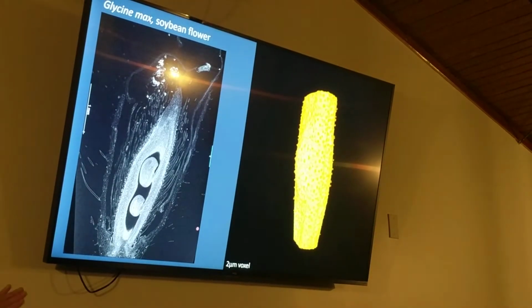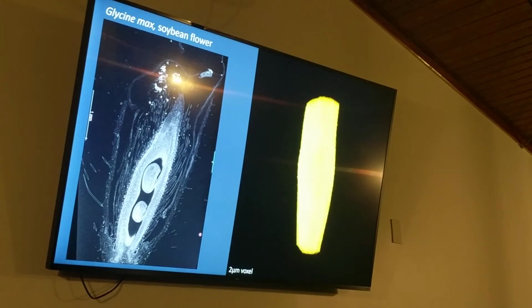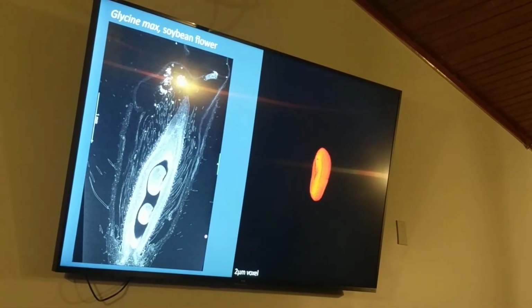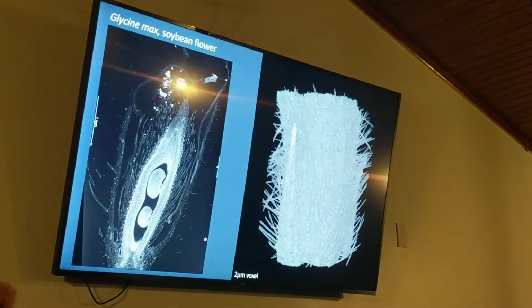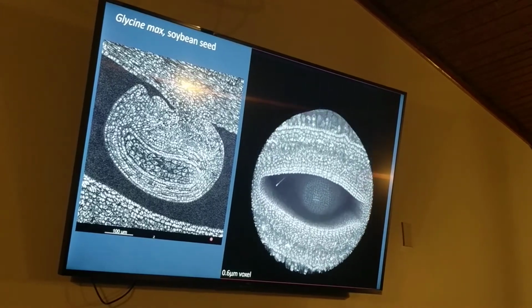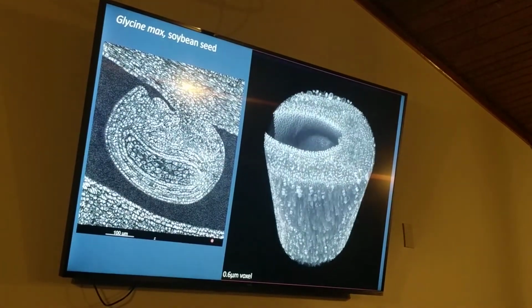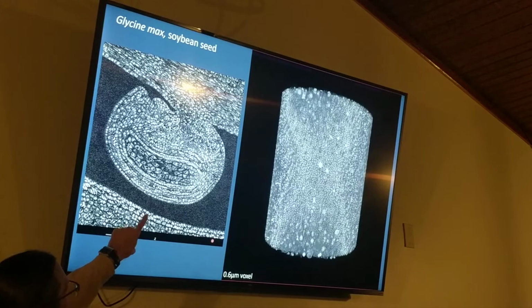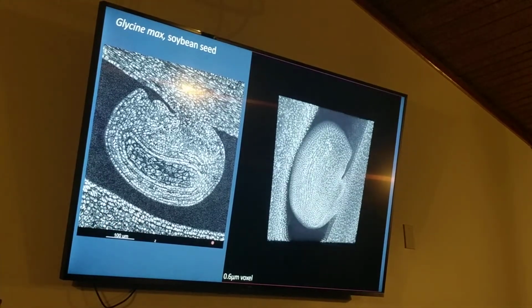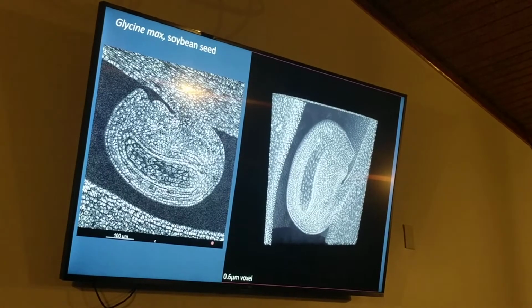That's what we're doing with this kind of imaging data. We want to identify specific structures and measure specific structures. Once they are identified on the computer, it's literally just a couple of buttons, boom, and we measure whatever it is we're going to measure. We have pretty high resolution. This is just one developing seed, and you can clearly see this is cellular resolution. This is just one slice, but we have that whole volume. Wow. We have the entire thing there.